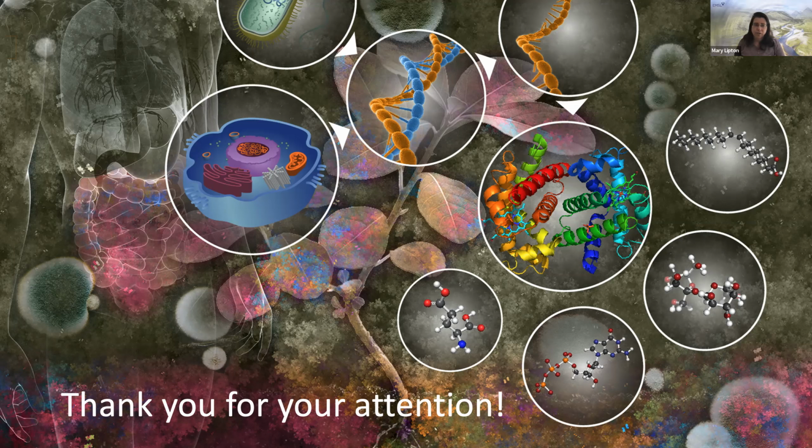At the moment, I think we're still at trial and error. If I was actually being given a lot of money to do something, what I'd really love to do is create a cookbook of types, try different extraction techniques on different soils with different clay contents, different sand contents, and see if there are those trends. But at the moment, we're under the gun, people care about the results rather than the correlations on the different sample types. So right now, I think that it's just trial and error. It's whatever works best for your soil. And even if I did give you some sort of insights and trends, they'd probably be wrong for whatever soil you came up with.